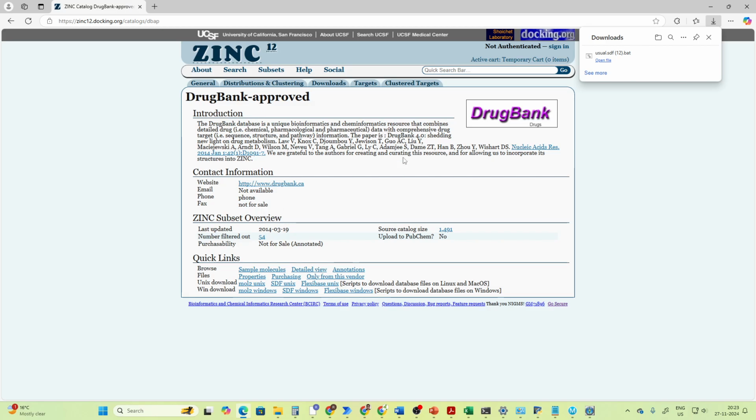I cannot just directly click and download the whole 1400 molecules. If the database is large, it will use up lots of memory, the transfer will take a long time, and if there is some kind of internet connection problem, it will break the whole download. So what they are doing is downloading this in batch file format.